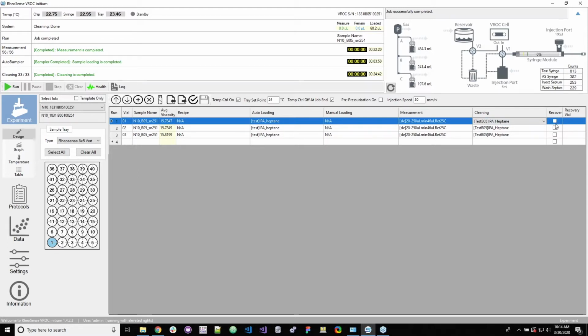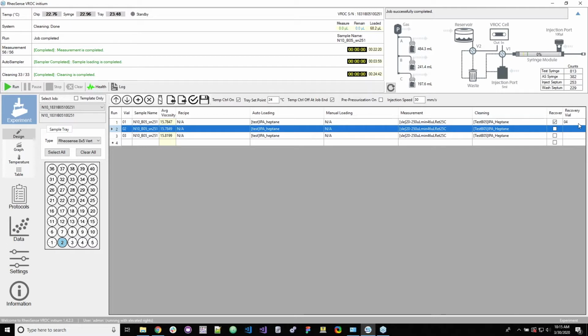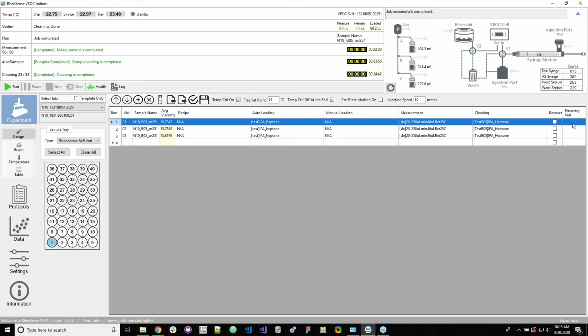And then here is the recover column. The recovery column is simply if you want to recover your sample after you've tested the sample. So you would click this box, and then you could specify which vial you wanted to recover the sample in. I recommend putting it in a different vial than the one that you drew it from. Since we have vials 1, 2, and 3 used in this example, we would just select vial 4 and have a fresh vial to recover the sample in. But I can go into more detail about that later.